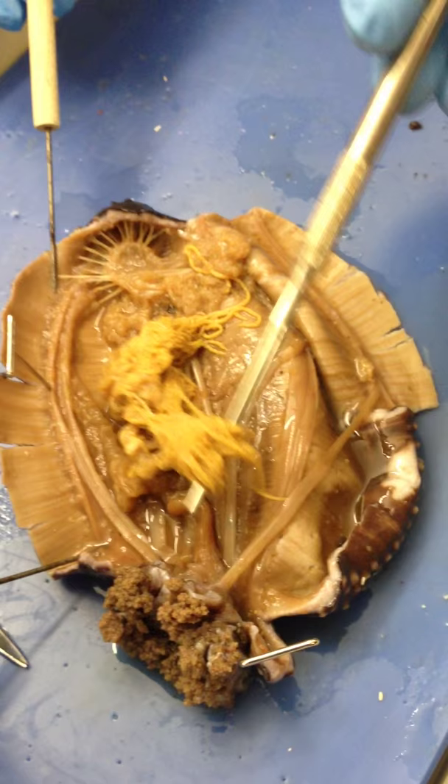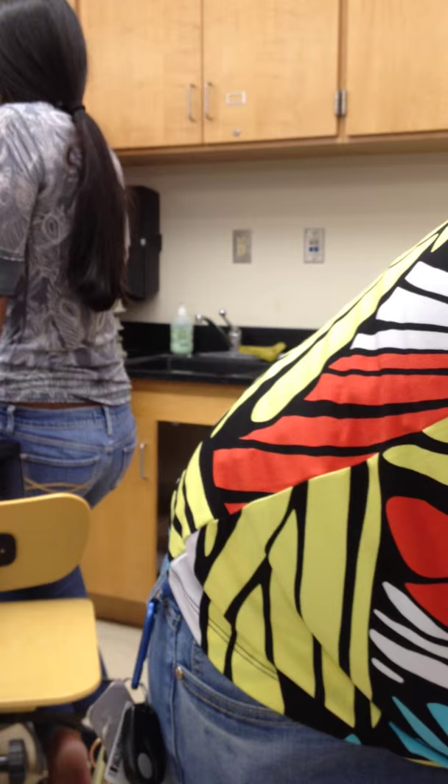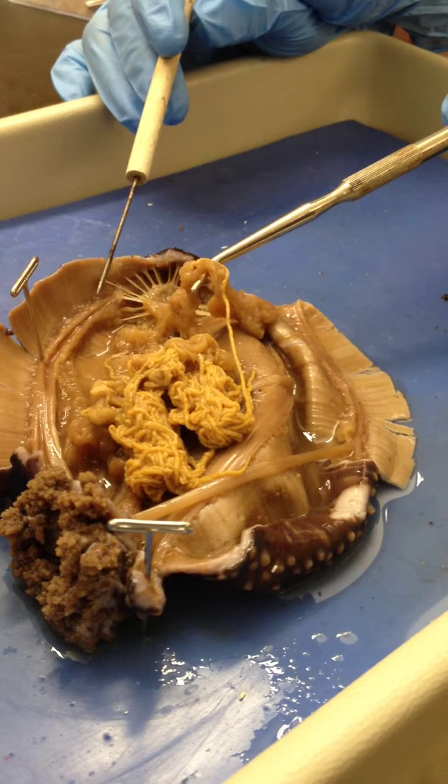This is a gonad. So this here is the gonad. Correct. Gonad looks like worms.